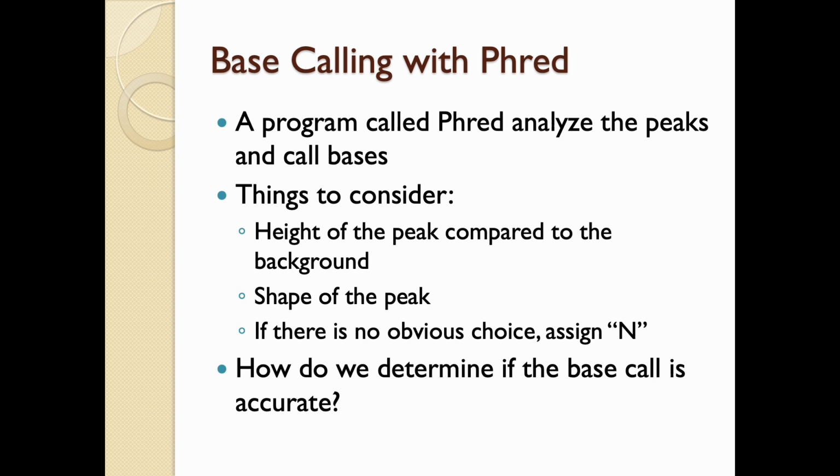As I mentioned earlier, base calling is often done by software like Phred. It analyzes peak height, shape, and background noise. If the software cannot confidently call a base, it assigns an N. We'll explore how accuracy is determined in the next slide.